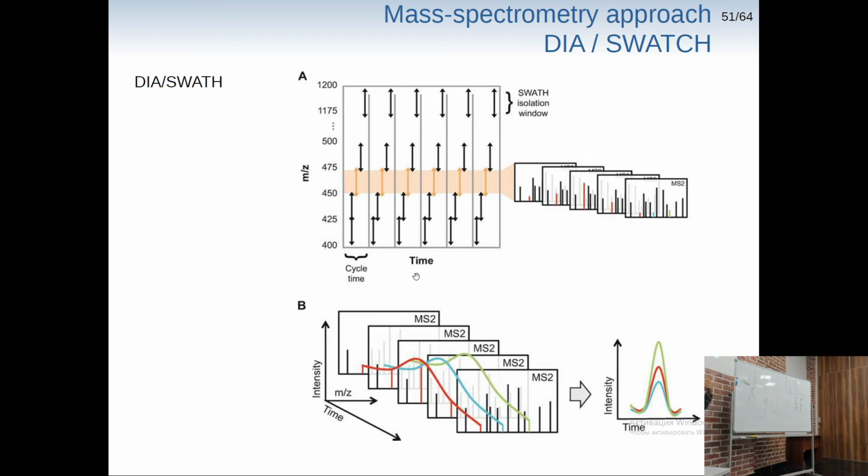And we actually try to get such an energy of fragmentation that at least some small amount of our precursor ion will not get fragmented. And we also see it somewhere there. It's not depicted here, but still it will be present in our sample. So we'll be able mathematically to get all the compounds that we have and all the possible fragments at the same time. Just a mathematical algorithmic problem. Was it clear?